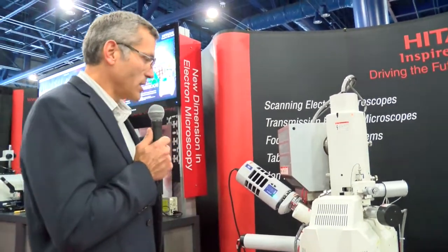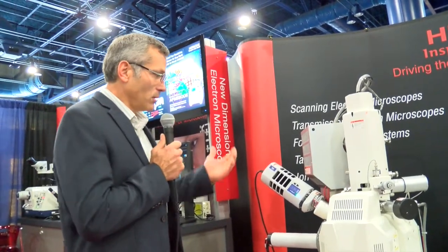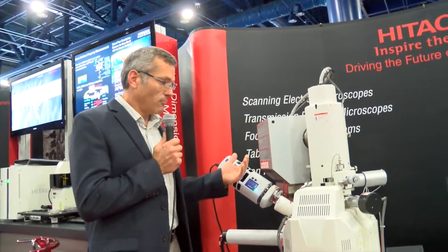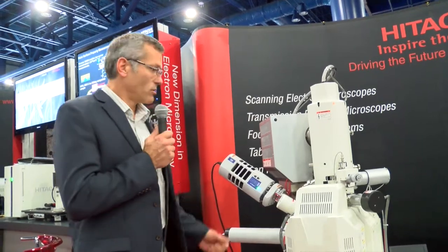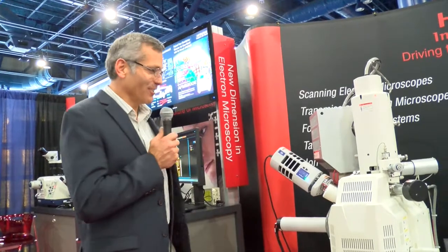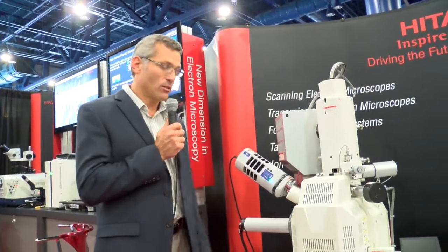The system also has a newly designed high vacuum and low vacuum system. One of the key features of the Hitachi variable pressure system is that we don't have to change out apertures when switching between low vacuum and high vacuum. The software lets you jump between low vacuum and high vacuum with a click of a switch.